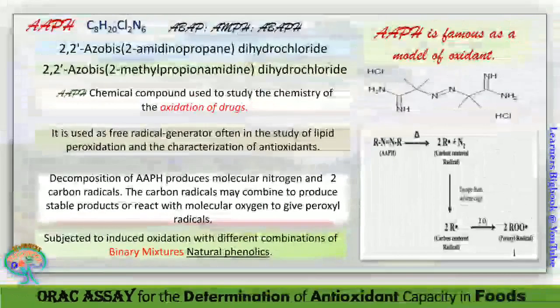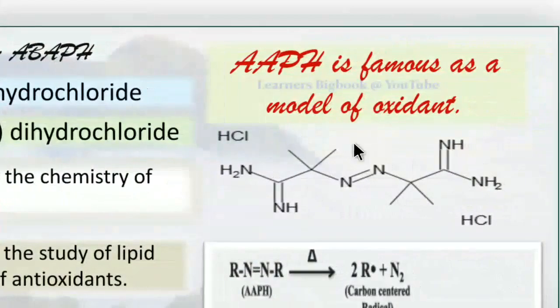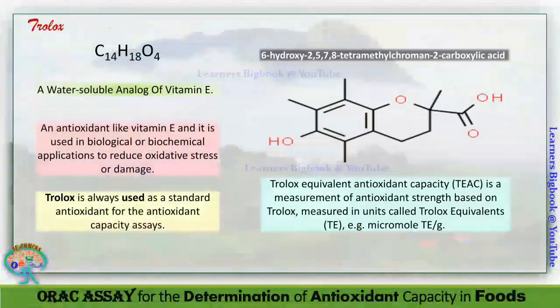Now you can see the AAPH structure here. So this is regarding the AAPH, and next in this slide we discuss the Trolox.